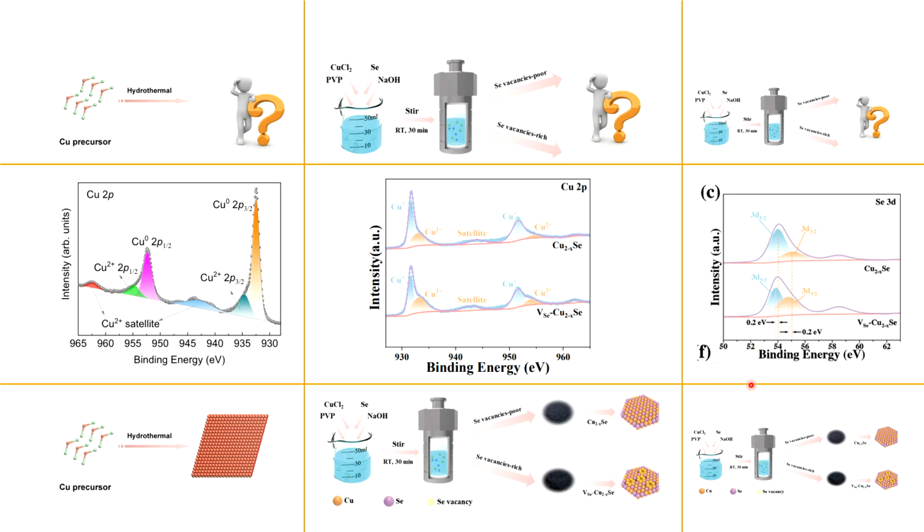So it means that vacancies and this kind of information we can also estimate from the XPS. Of course, we need other characterization later, but this will help a lot. So this is all about this video, and like this we can estimate many other different structures on the basis of the XPS. So the basic things which we see, I tried to show in this video.